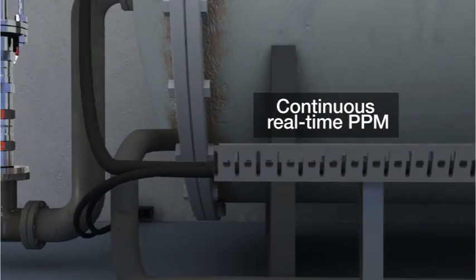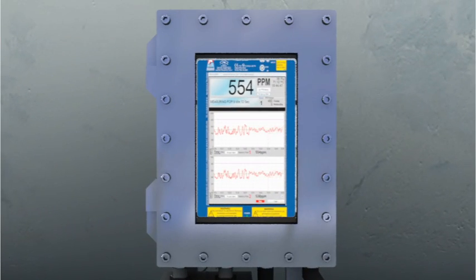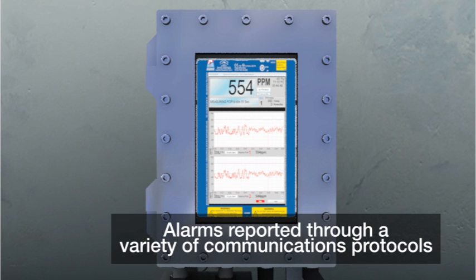Continuous real-time PPM is measured and reported. Any alarms violated are reported through a variety of communications protocols.